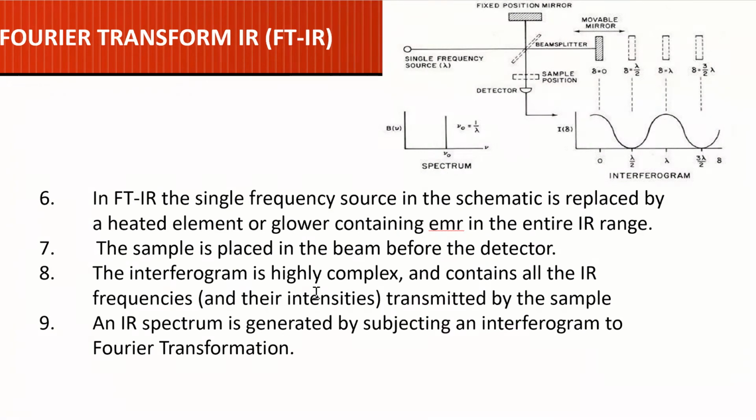The interferogram is highly complex, and as we said, we're not going into that, and contains all the IR frequencies and their intensities transmitted by the sample. An IR spectrum is generated by subjecting an interferogram to Fourier transformation.